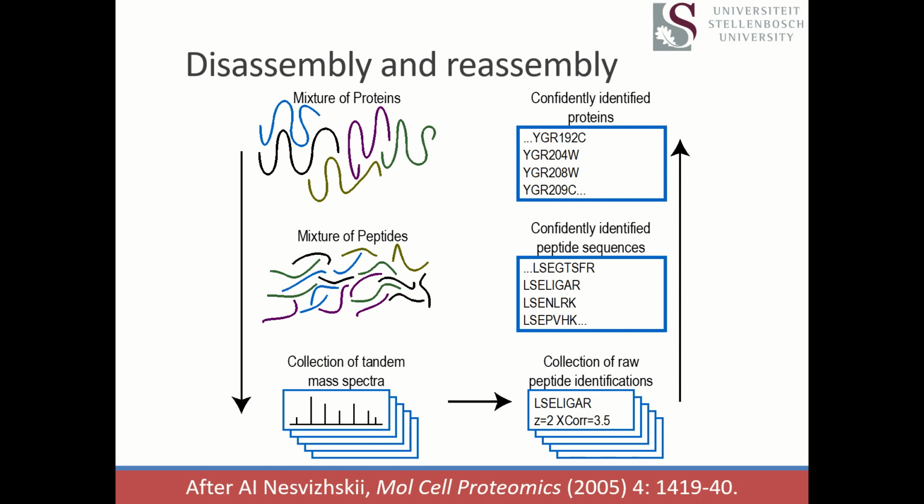That's the process that gets us from a pile of PSMs, peptide-spectrum matches, to a set of peptide sequences that we really trust. And then from that, we're going to infer a set of proteins to explain the peptides we've seen. All right? So we started on the bench with a bunch of proteins, digested the peptides, produced tandem mass spectra, and now we're going to produce a bunch of PSMs, figure out which peptides we actually trust from that collection, and infer the proteins back.